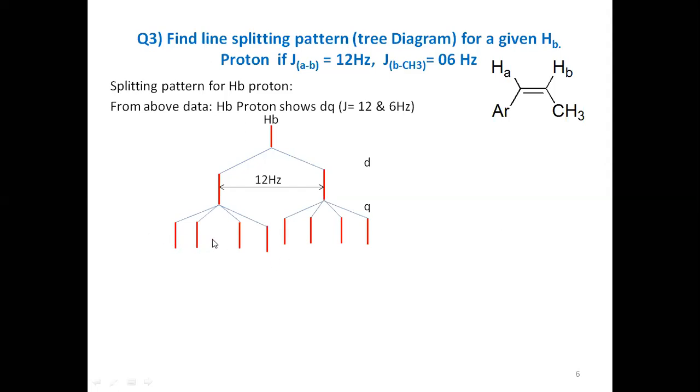So the distance between these peaks, how much is the value of that arrow? Is it 6 hertz, 3 hertz, or 2 hertz?